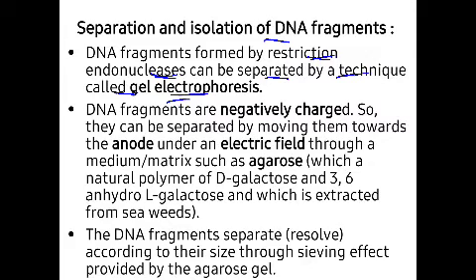So after fragmenting this DNA, we know that DNA is negatively charged.